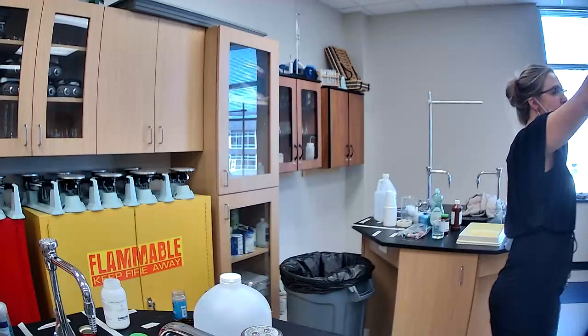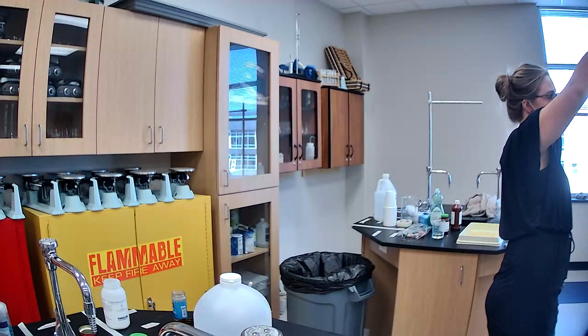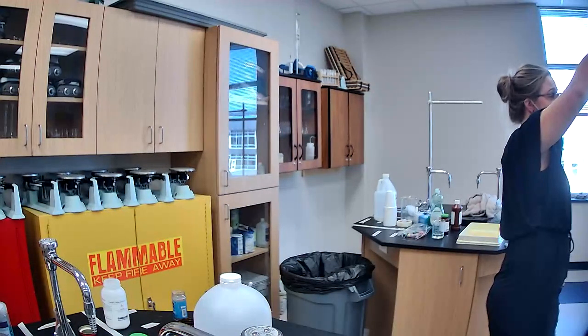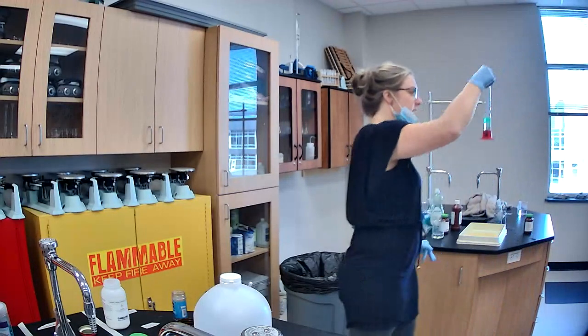Why is it on top of it? Is it more dense or less dense? Very good. The soap is less dense, so it's sitting on top.